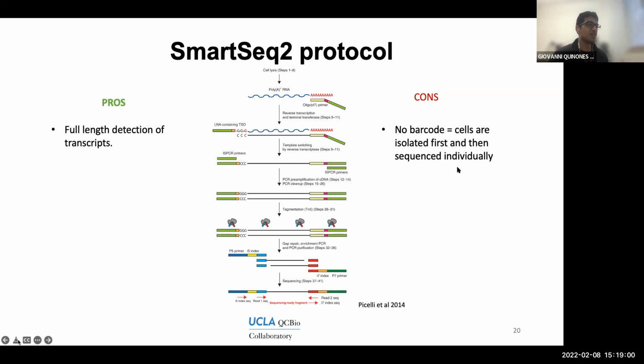They are using individual experiments to sequence each cell at a time. So there is no multiplexing. Like I mentioned, there is no multiplexing. We never pull together the reads from different cells. And because of that, you don't really need to label what cell they came from.